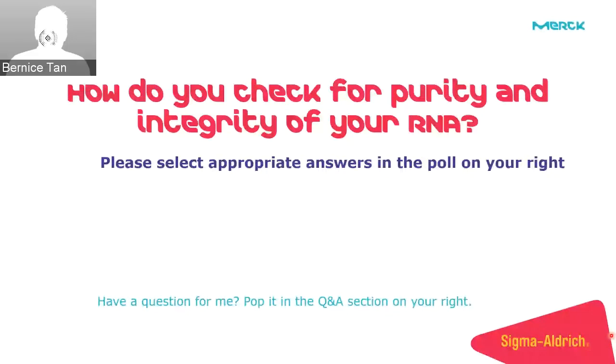So let's have a look at the results. A lot of you are saying that you are using a spectrophotometer, such as a NanoDrop. And then some of you are using a spectrophotometer, such as a NanoDrop, for purity, and then also running an RNA gel or using the Bioanalyzer. I'm really happy to see that. So thank you for your time.